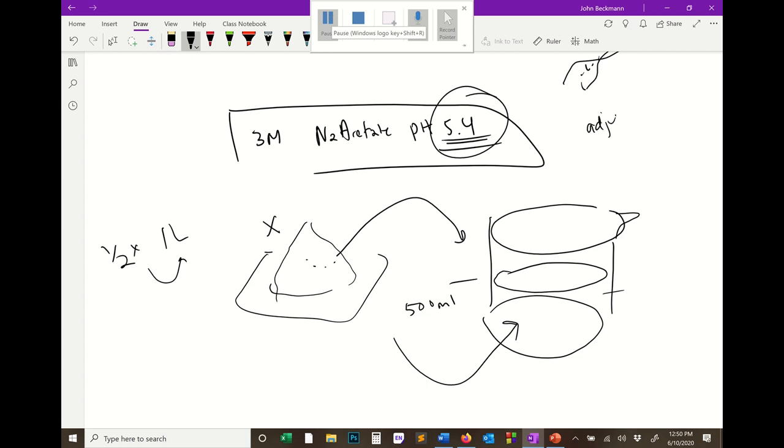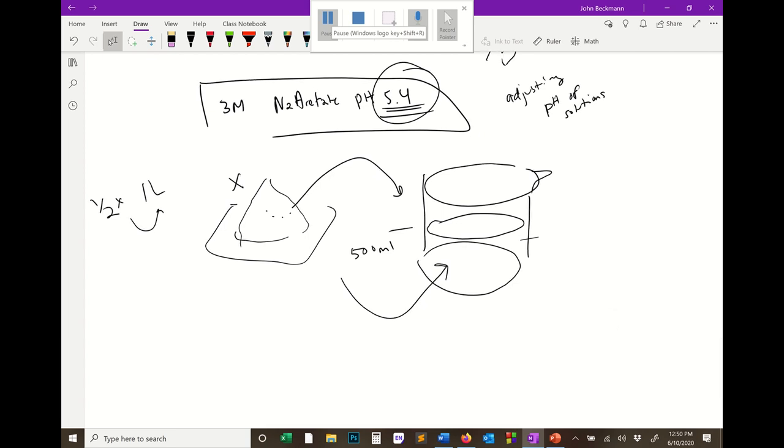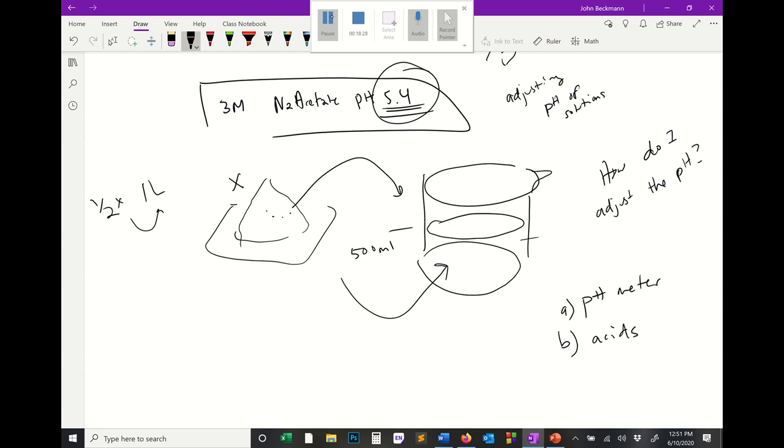So what we're talking about here is adjusting the pH of solutions. As you're faced with this conundrum the first day in the lab, you're going to ask yourself, how do I adjust the pH? In your lab, you're going to have a few tools. You're going to have a pH meter, and near that pH meter, I bet you're going to see some bottles filled with acids and bases, things like hydrochloric acid, acetic acid, phosphoric acid, okay?